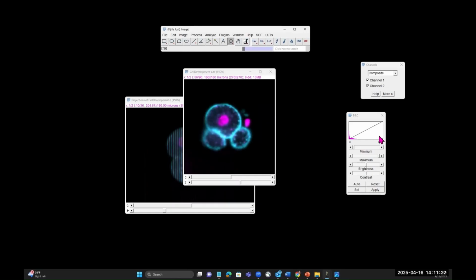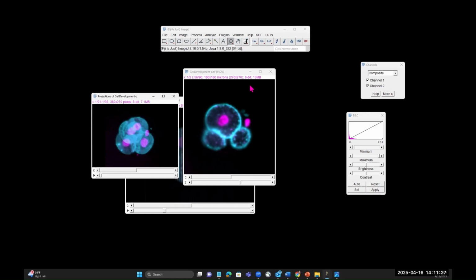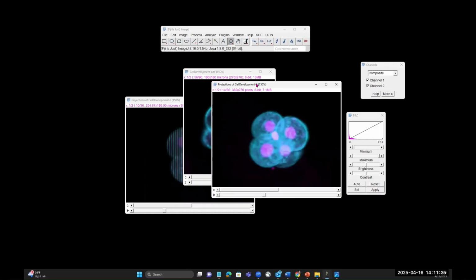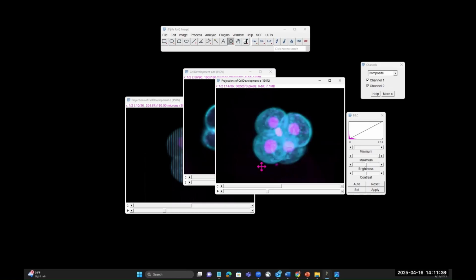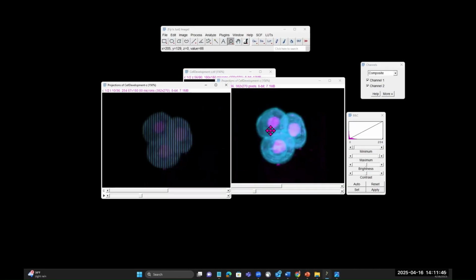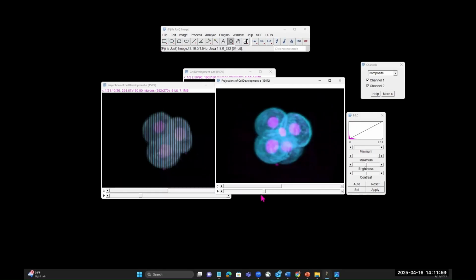That way, when you create your image, it would interpolate through all those empty spaces so that your image would look smoother. So let's say this is at image 10, so I'm going to go back to 10 here. If you compare, you have an image like this versus an image like this. Obviously, you would want to present a movie with this kind of projection rather than this, okay?